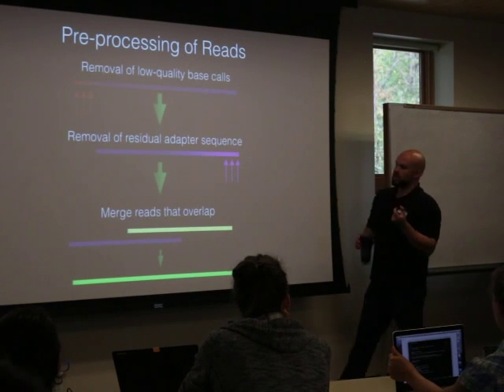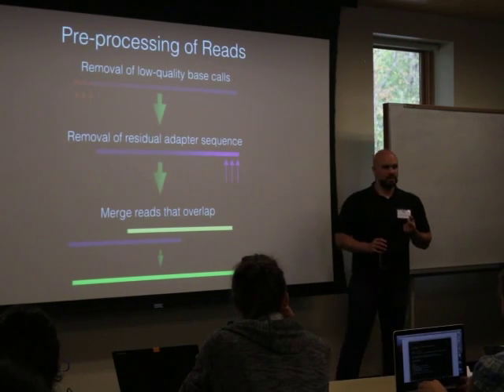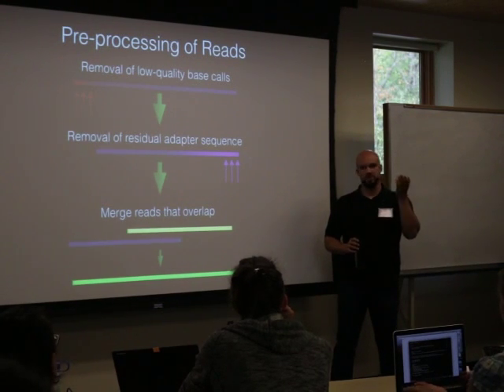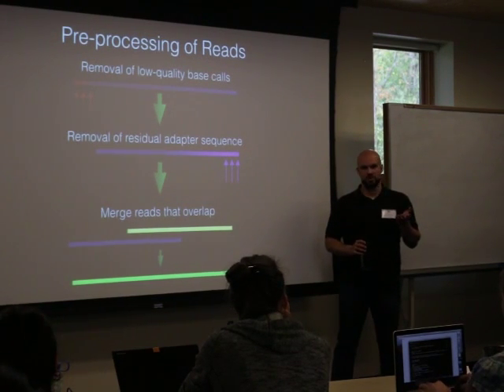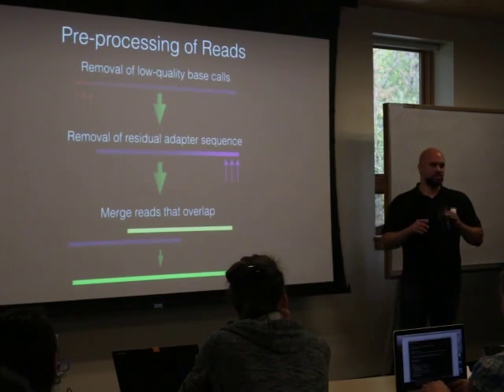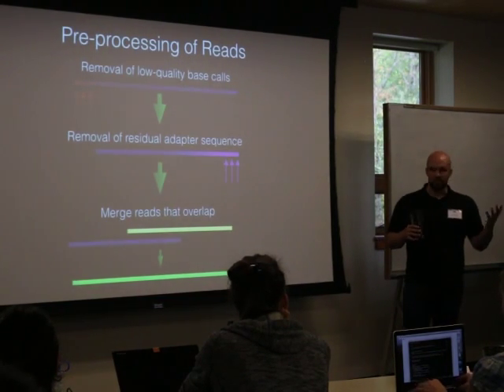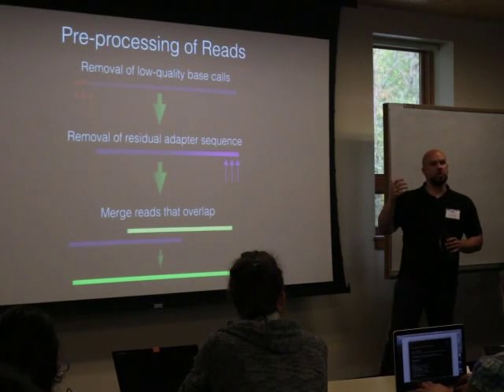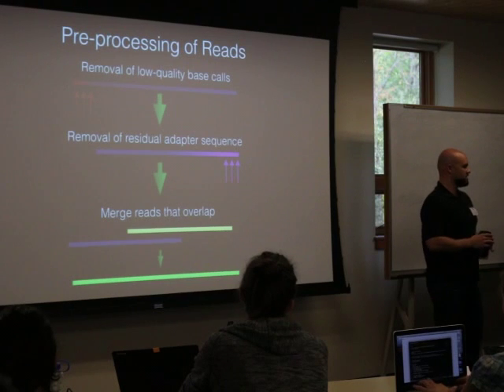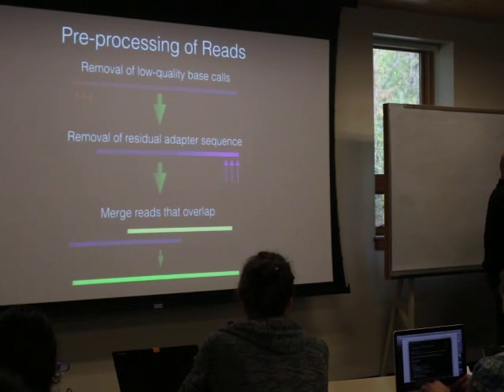And what had ended up happening is that a graduate student had neglected to clean the reads, and so a bunch of junk reads were going in, and there was variation that was being identified by virtue of either sequencing error or mapping error, any of these sorts of sources of error introduction in general, that were then actually showing up as variants in the raw data, in the final data set. I don't know if it actually has filtered.